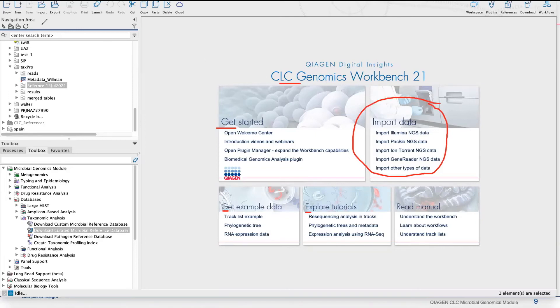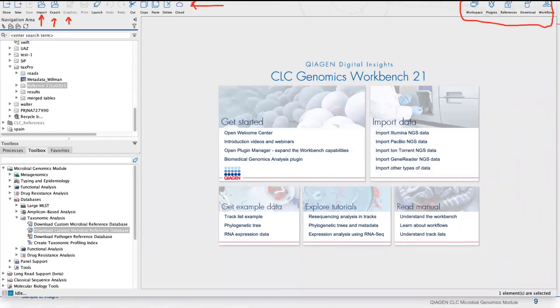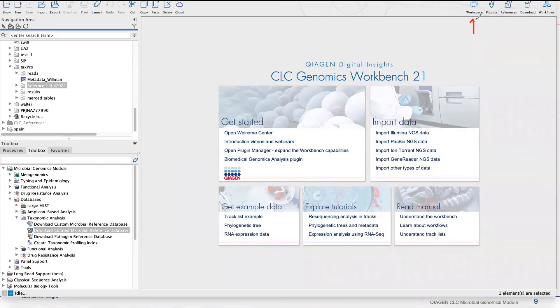I tend to use the import function in the upper left-hand corner. When I talk about import today, that's where I'll be pointing. We'll also see the export and our ability to produce graphics across the top toolbar, along with copy, cut, and paste functions. In the upper right-hand corner we have workspaces — think of them like tabs for multiple projects, giving you a way to organize projects and have multiple data sets open at once.